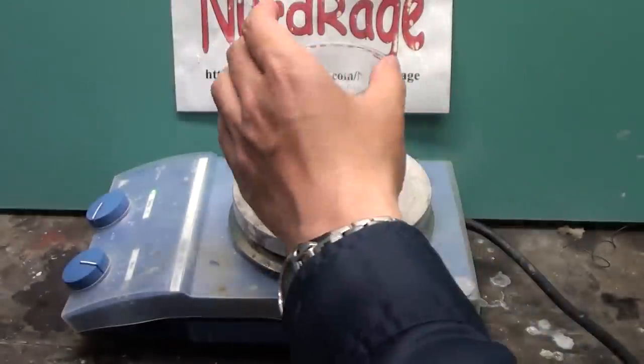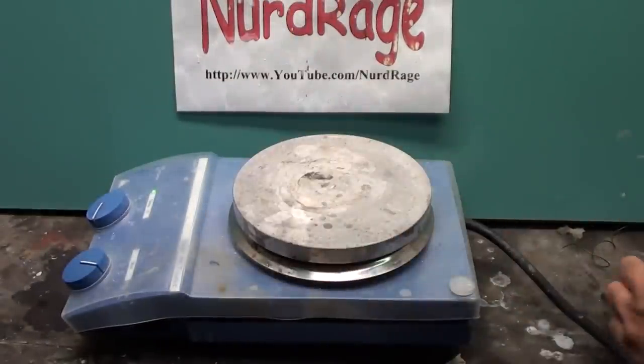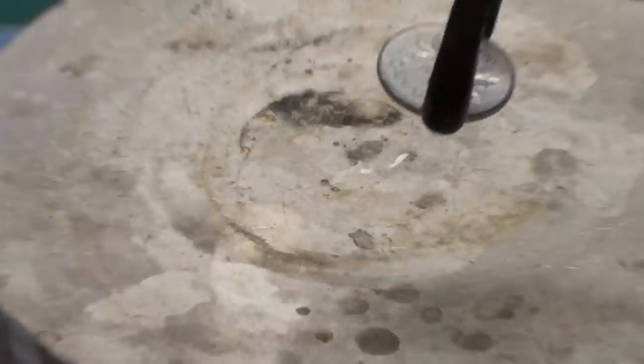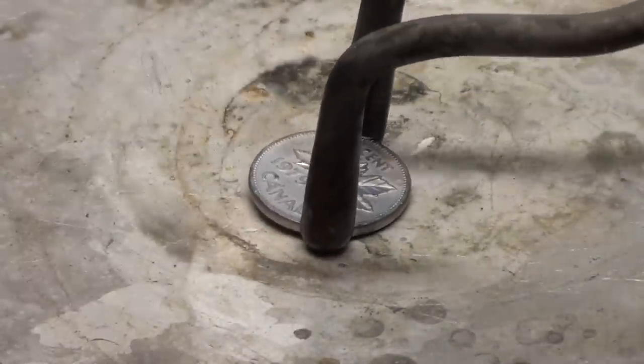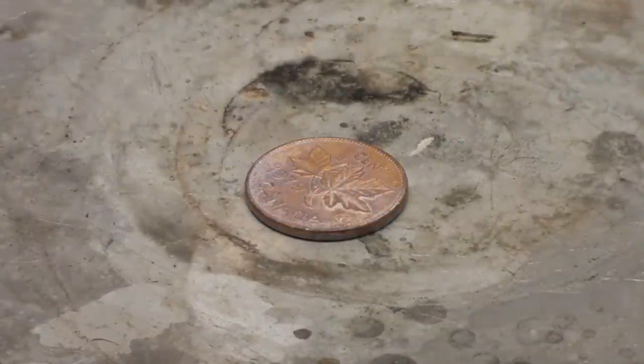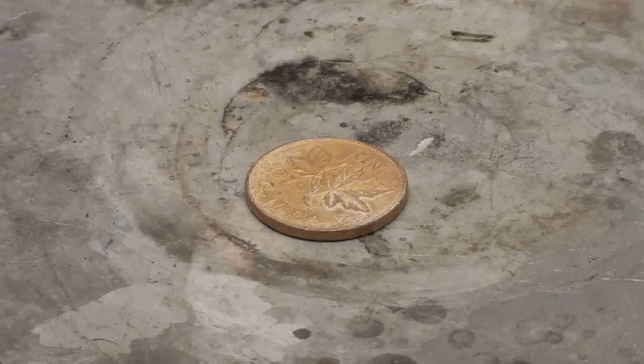Now for the most amazing trick — turning it into gold. Let me wash it first. Simply put the coin directly onto the hot plate heated to about 300 degrees Celsius. As it heats up, the zinc diffuses into the copper and produces a yellow brass.